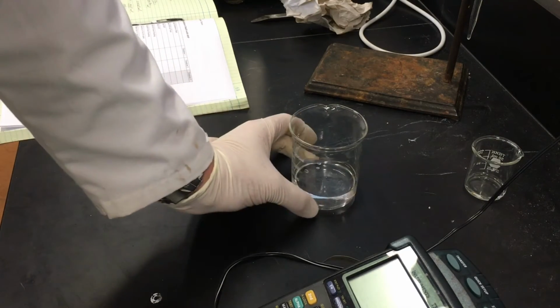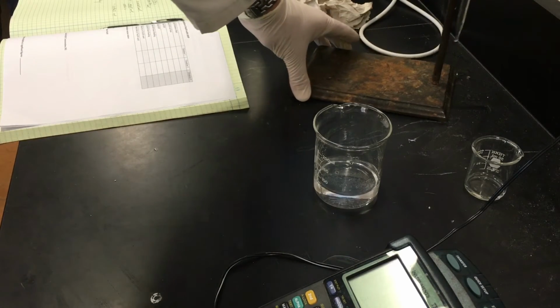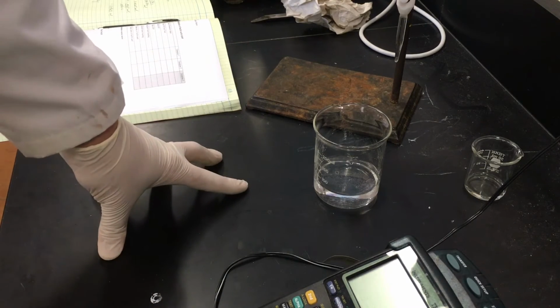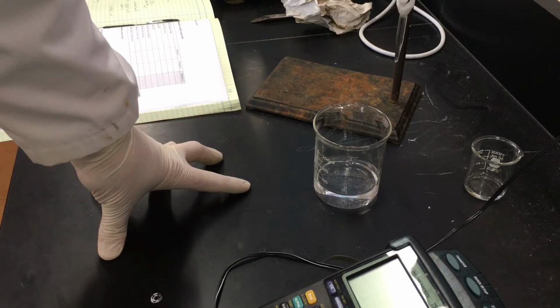And now we're going to make a titration curve, and so we're going to add our NaOH, and we're going to add 2 milliliters at a time until we get to about 20 milliliters used, and then we'll switch to half a milliliter at a time until we get to the end point.